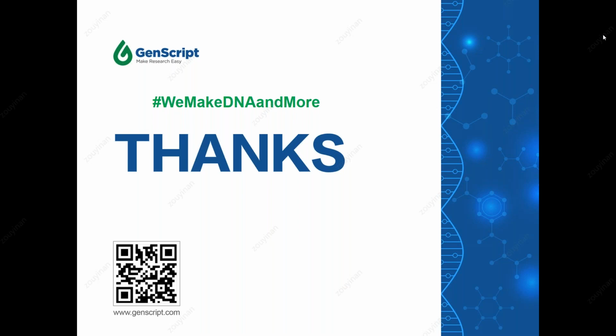And if the clone library is the final deliverable, we want to know where the insertion site is on the backbone. In some cases where the wild type sequence needs to be replaced with the mutant sequences, please indicate the exact range that you want to replace.